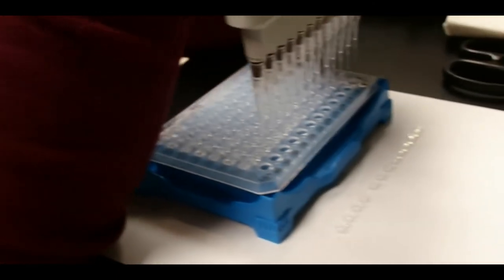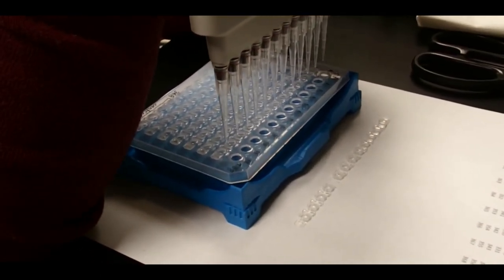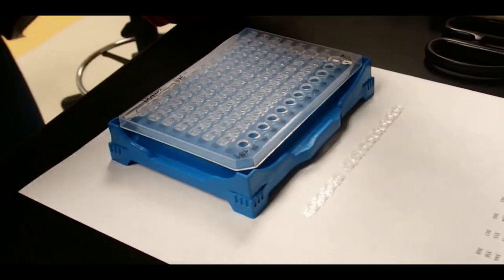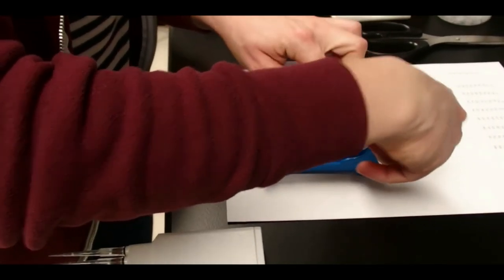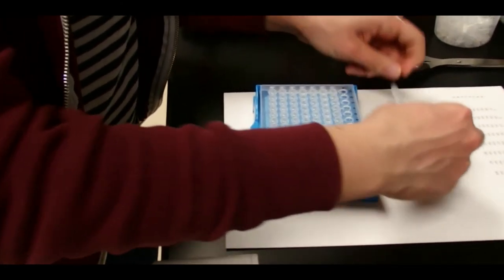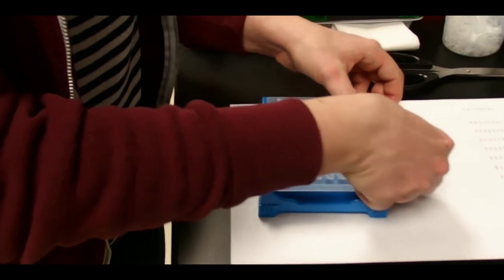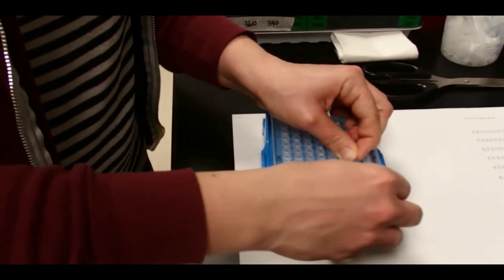And she's going to try really hard not to touch the wells and just shoot it in so that we can use the same tips. There you go. Mm-hmm. Pretty happy with that. And we'll set this off to the side, cap that up. And off to the next row. Again, soon we'll have 12 strip caps instead of 8. Today we were short of supplies.